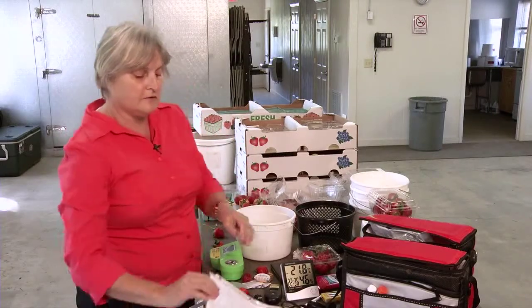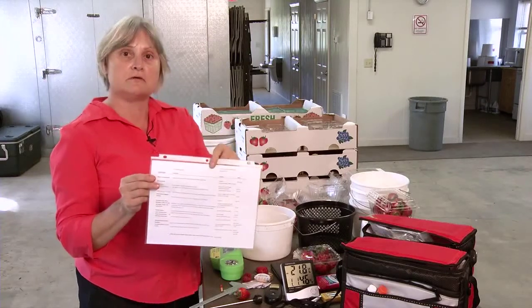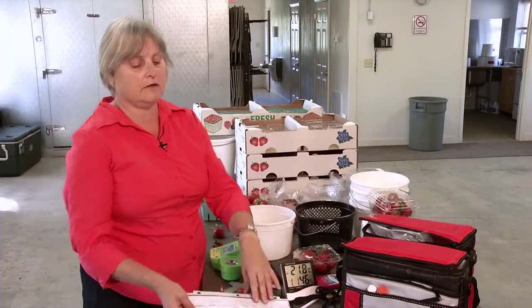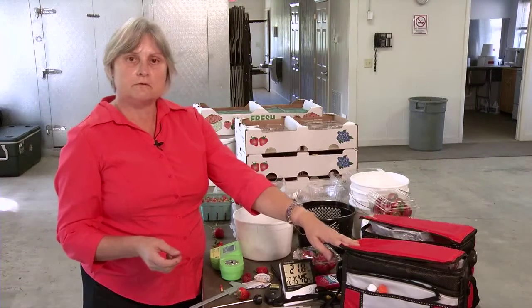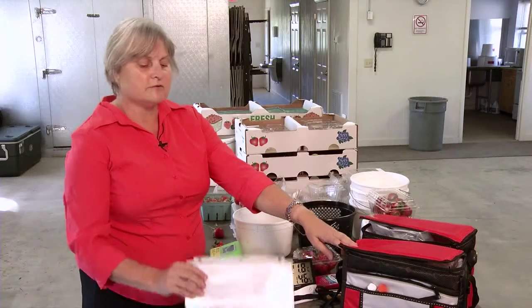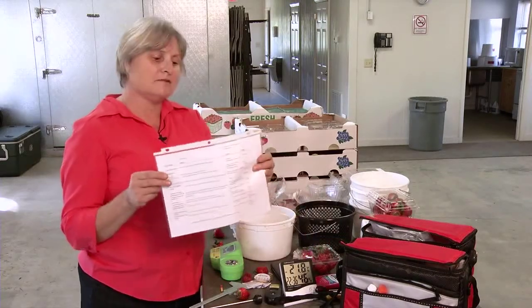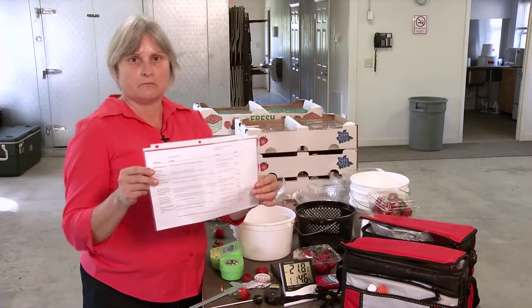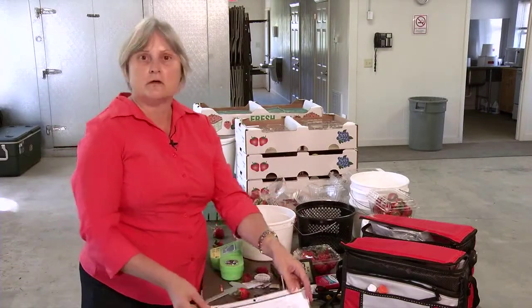The last thing I have here is a list of all the components, where you can buy them, and the relative price range. We started out with this as a grant, experimented with putting the kits together, and figured out what was useful to people. Now we're going to start selling them online for about $300. You can buy these yourself — the whole point is that you can do it yourself if you want to, hitting sales and everything else, and do it for around $250 to $400 depending on what you want. But we're going to offer this as a service for $300 if people want that.